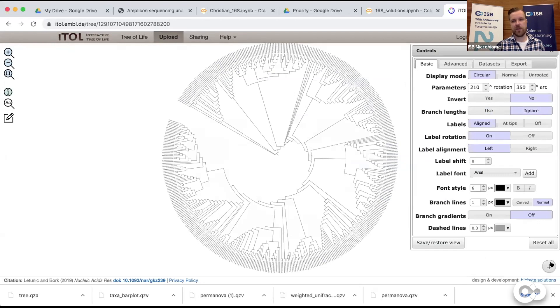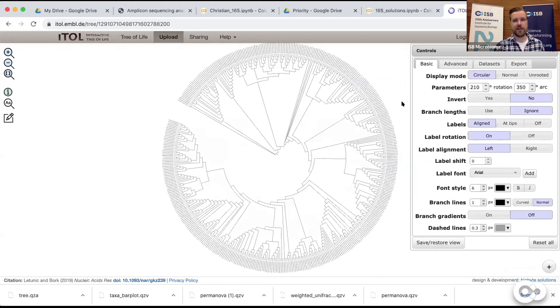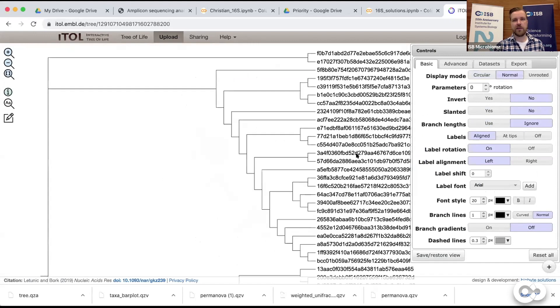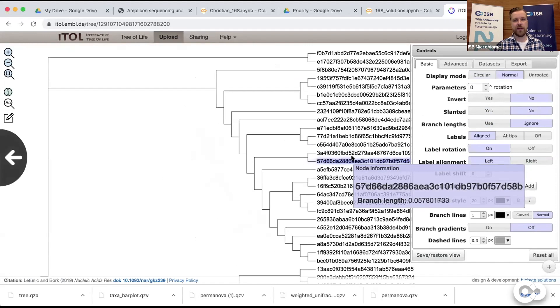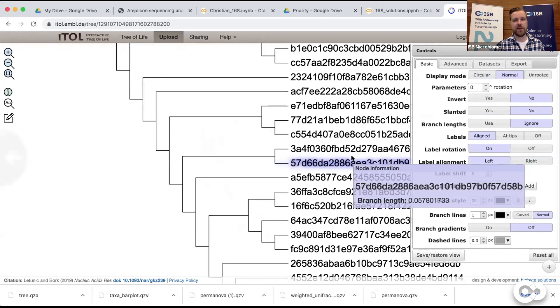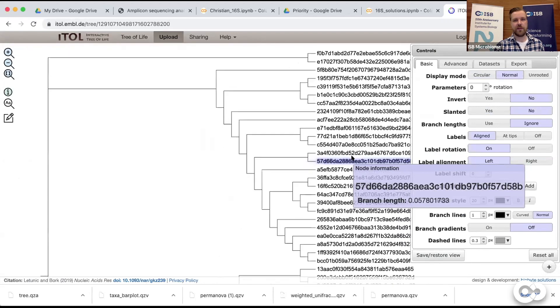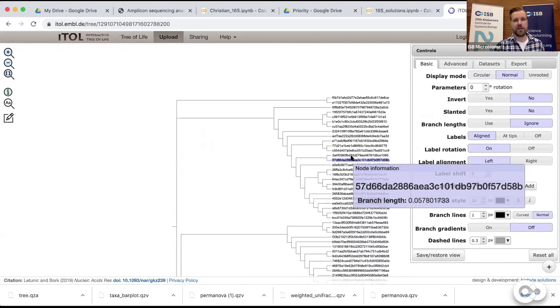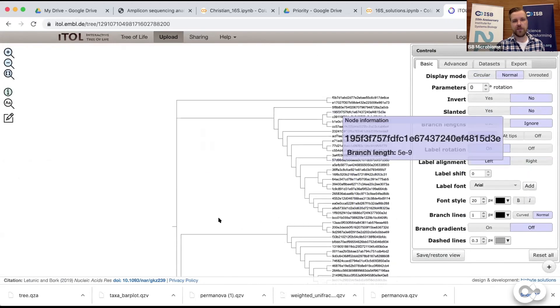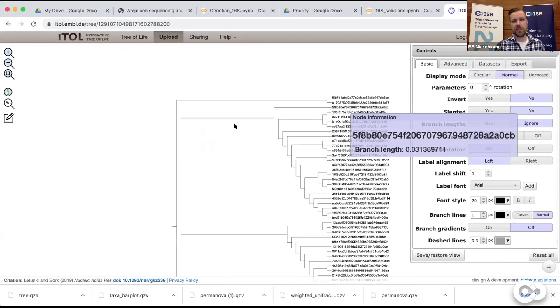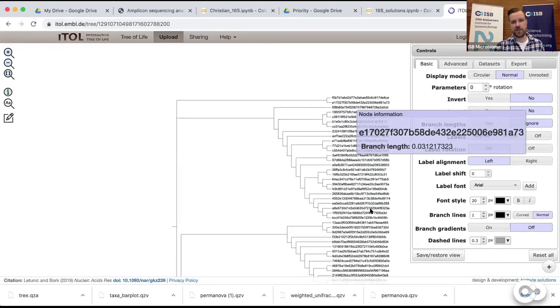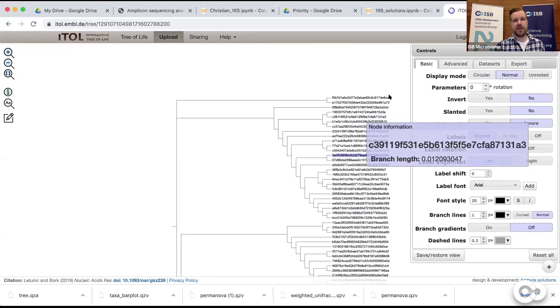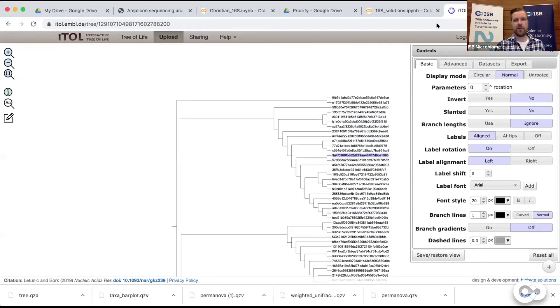Then what you probably did is take that plus button, upload the other data to visualize it. You can also make it non-circular, which sometimes is nicer if you wanted to read the labels. Then you can zoom in with your mouse wheel which gives you the same tree but it's aligned in a non-circular fashion.